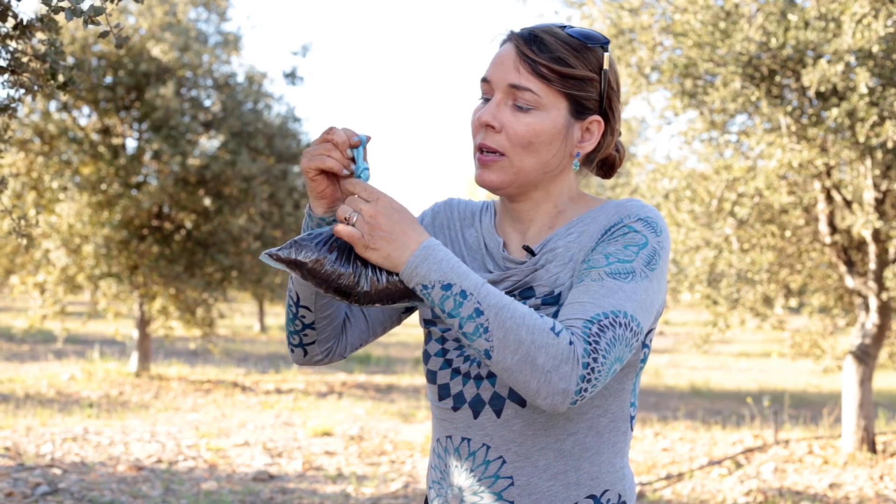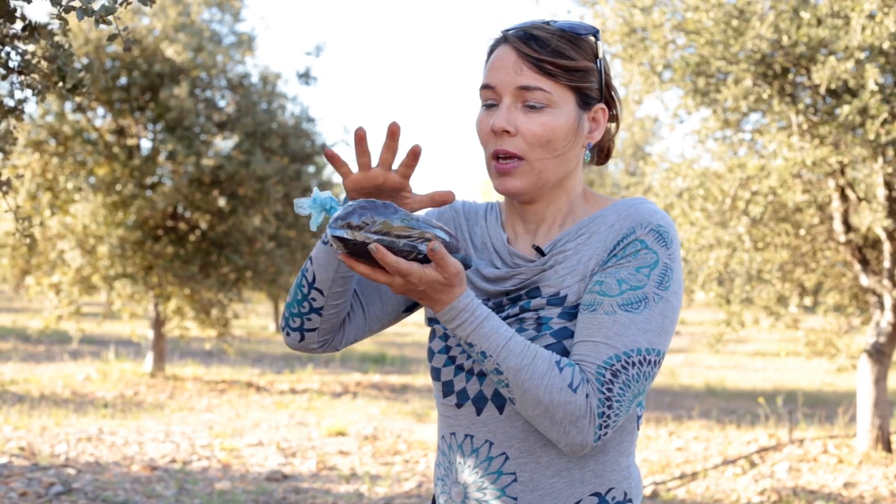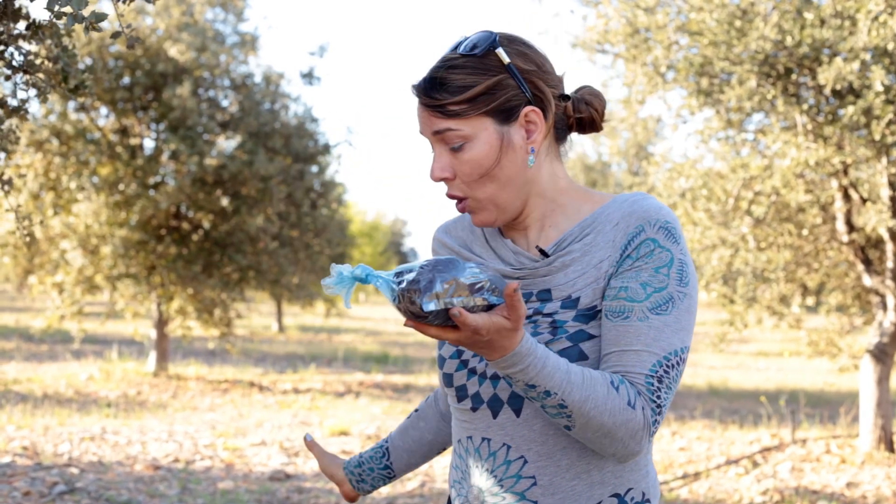Then we just make a knot. Please make sure the label is not on the knot, so when the samples get to the lab we can organize them without having to open the knot. And that's it — now we just cover the hole we made and move on to the following tree.